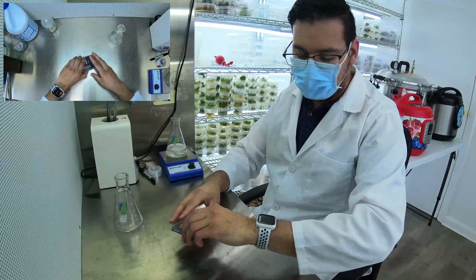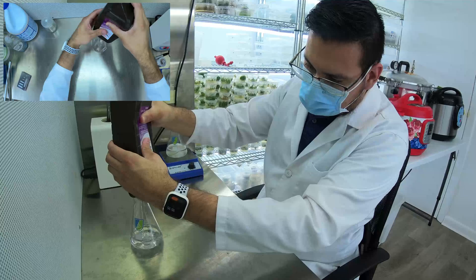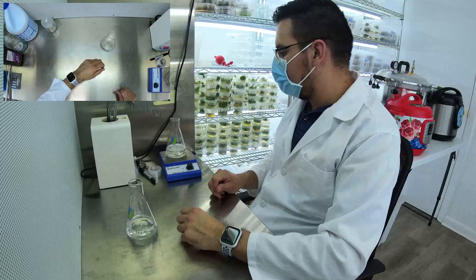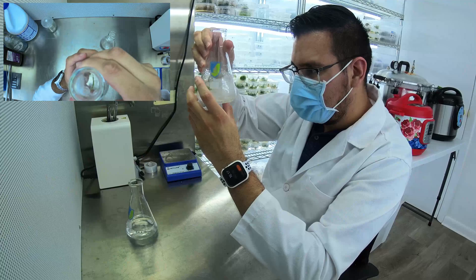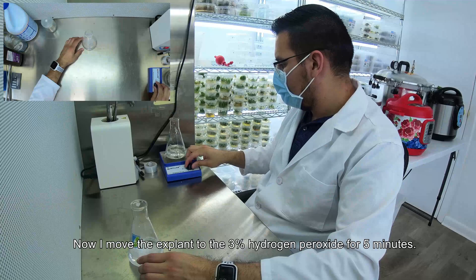To rinse the explant I will use 3% hydrogen peroxide for 5 minutes. This is how the explant looks after 30 minutes in 1% bleach. Now I move the explant to the 3% hydrogen peroxide for 5 minutes.